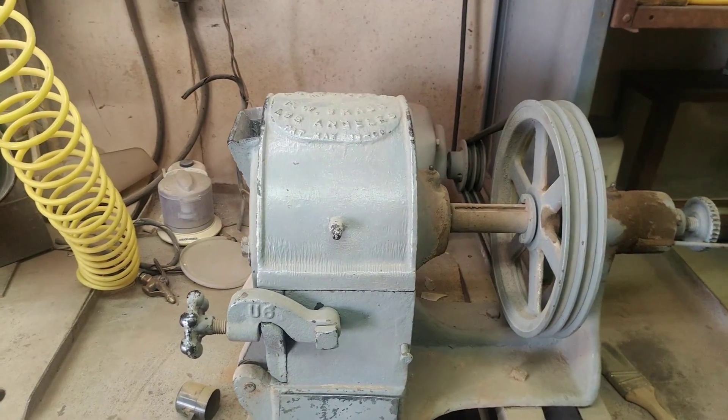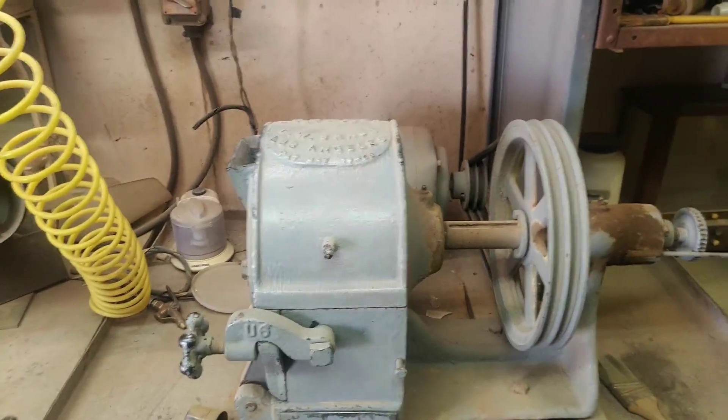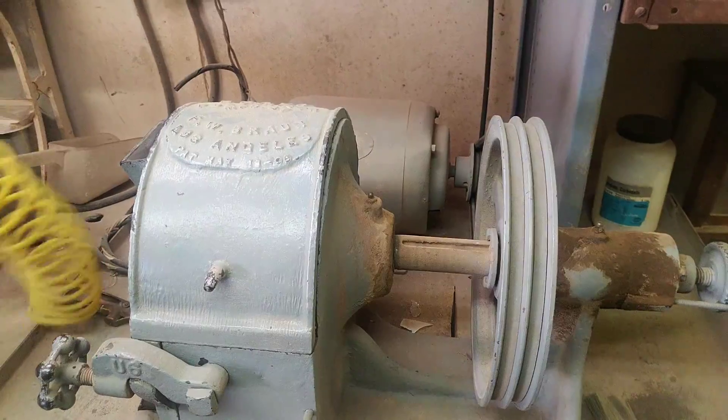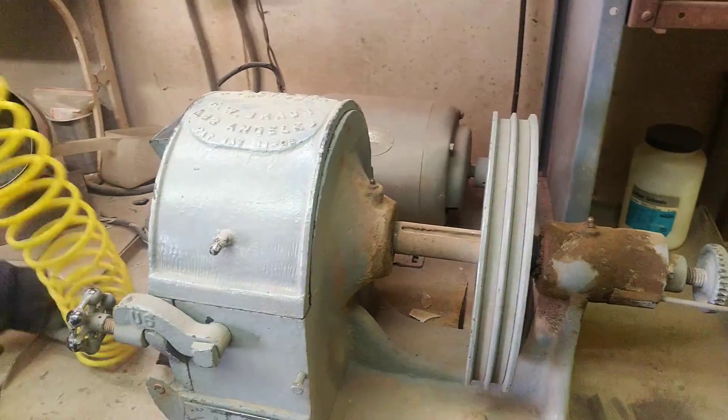Can you explain mesh? Mesh refers to particle size. The higher the mesh number, the smaller the particle. Like 200 mesh is essentially dust.